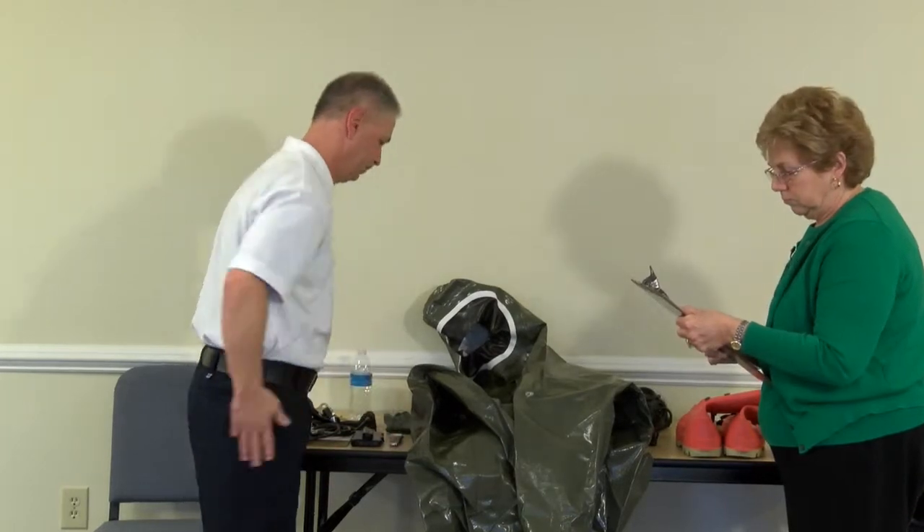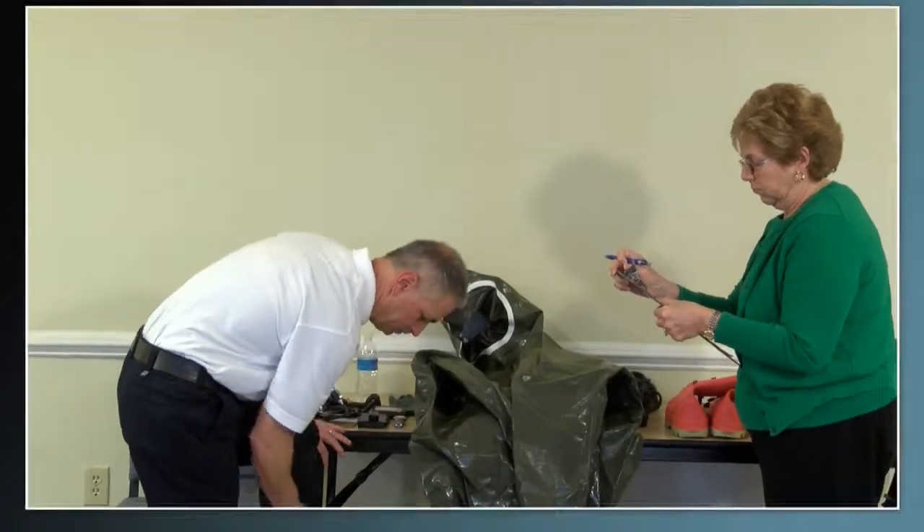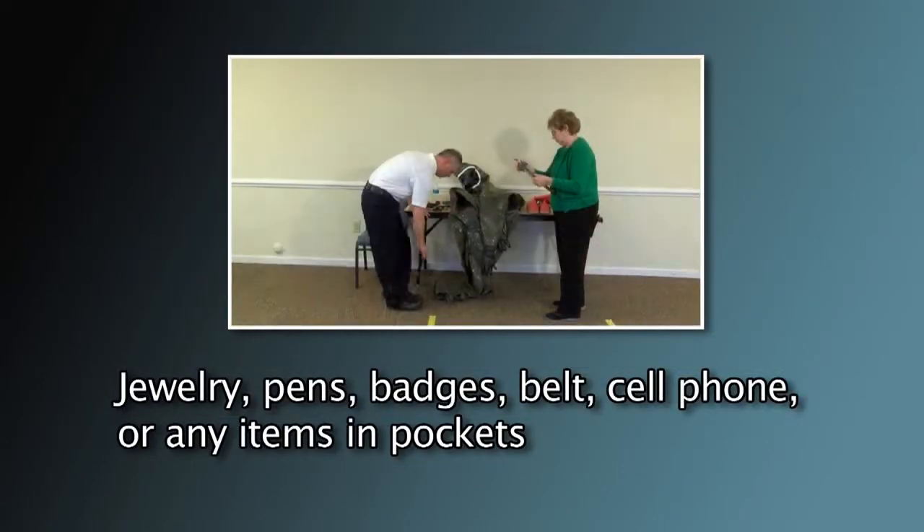Workers should remove anything that has the potential to poke a hole in or interrupt the integrity of the PPE, including jewelry, pens, badges, belt, cell phone, any items in pockets, etc.